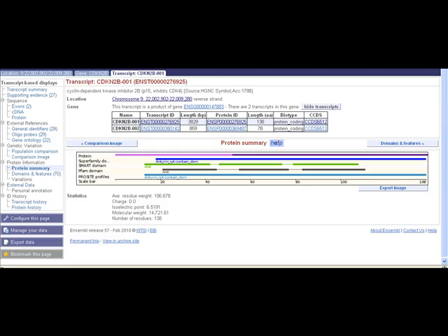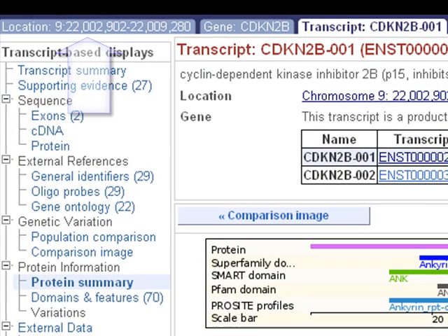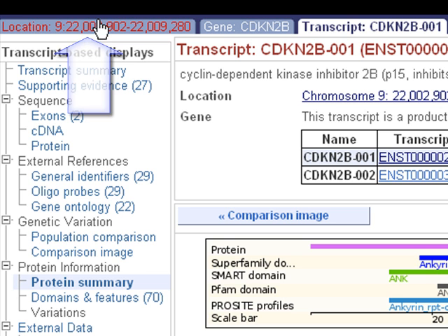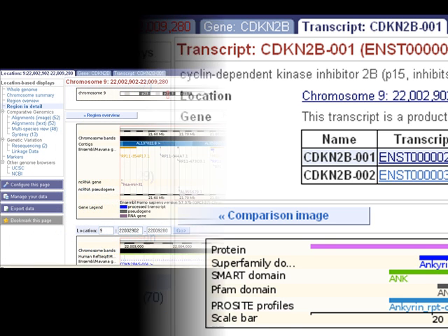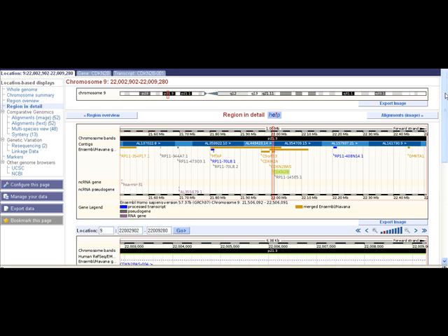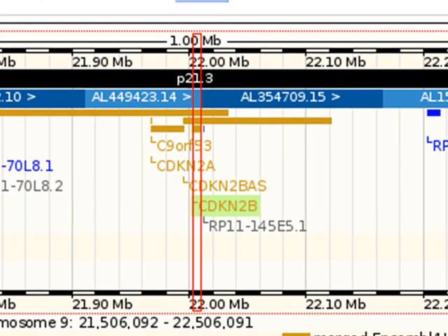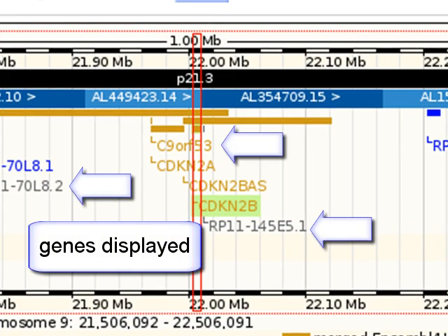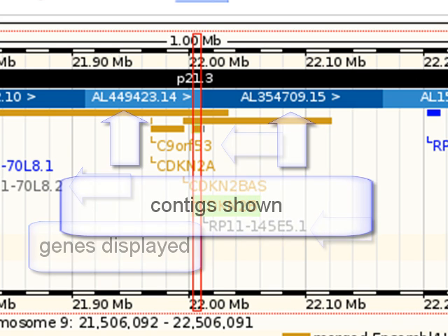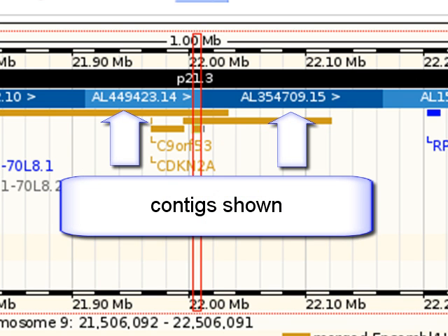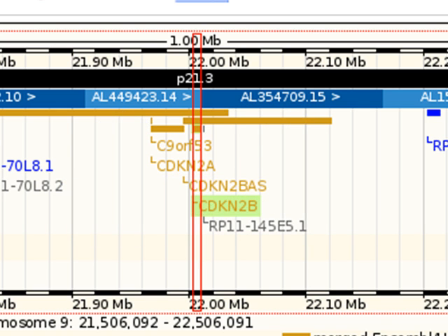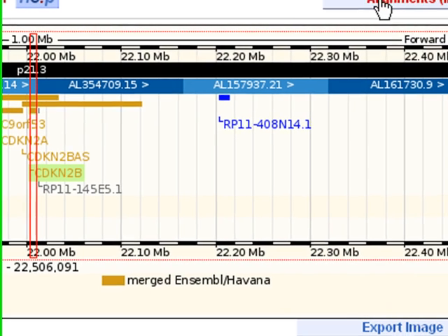We've looked at a gene and one transcript. Let's look at a larger region of the genome. Click the location tab to go to the region in detail page. The CDKN2B gene is highlighted, and neighboring genes are shown along the chromosome. Contigs are shaded in light or dark blue to show where they are in the genomic sequence. You can click on a gene or click and drag your mouse to form a small box to recenter the display.